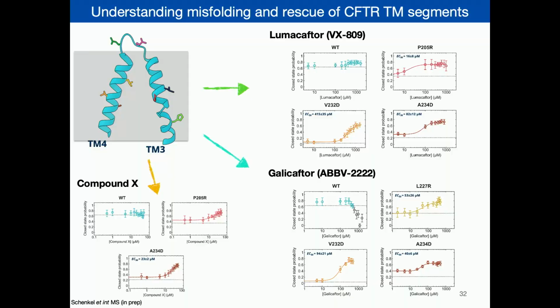And we can find a small molecule that, by titrating it in, corrects the folding. We can do that for different molecules, and I show only 3 here, where we can actually find that they are active depending on the mutation. And we have also the collaborators in Italy that developed a new molecule that shows activity also on 2 other mutations.